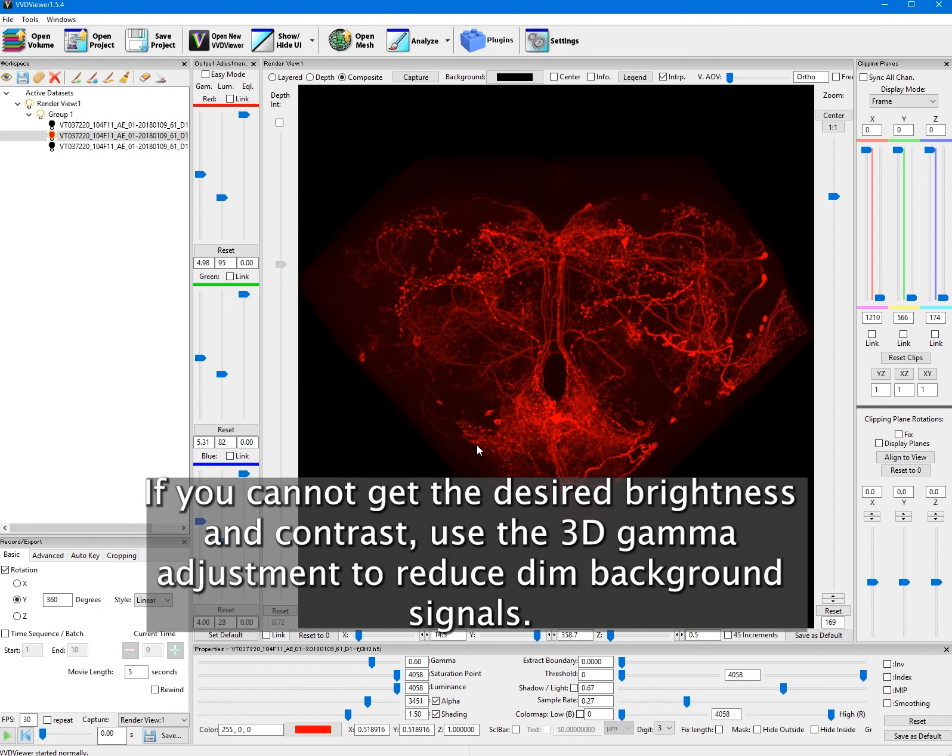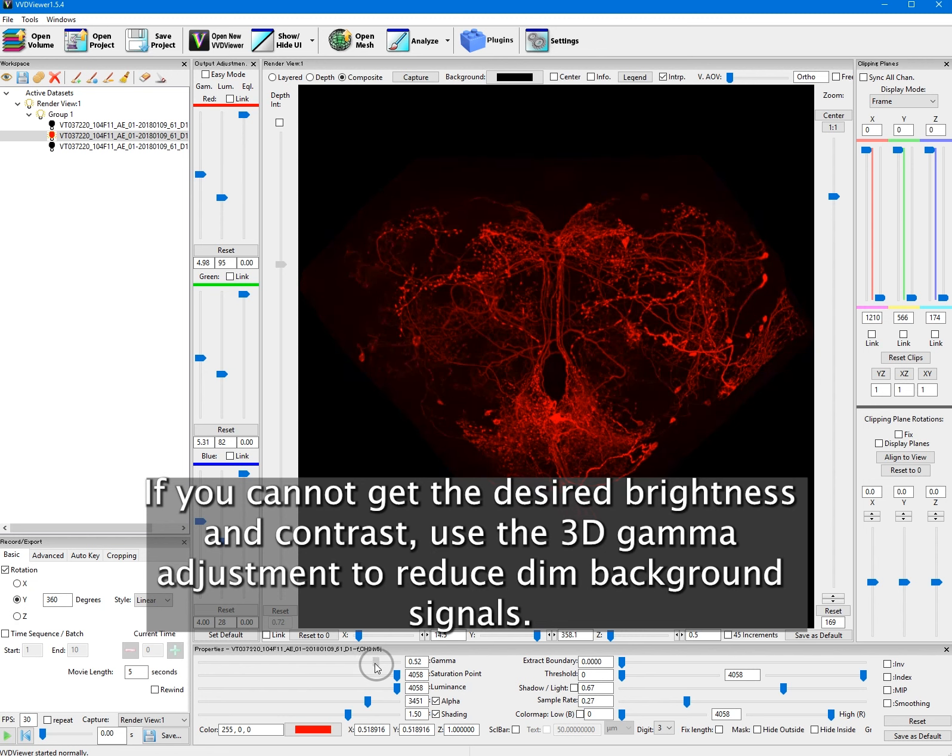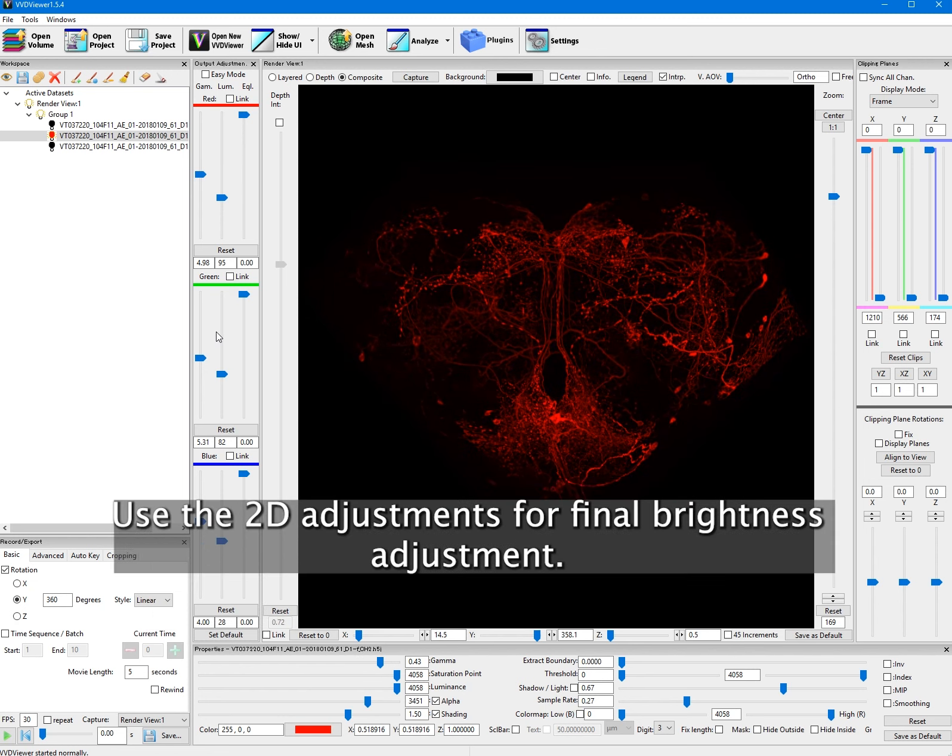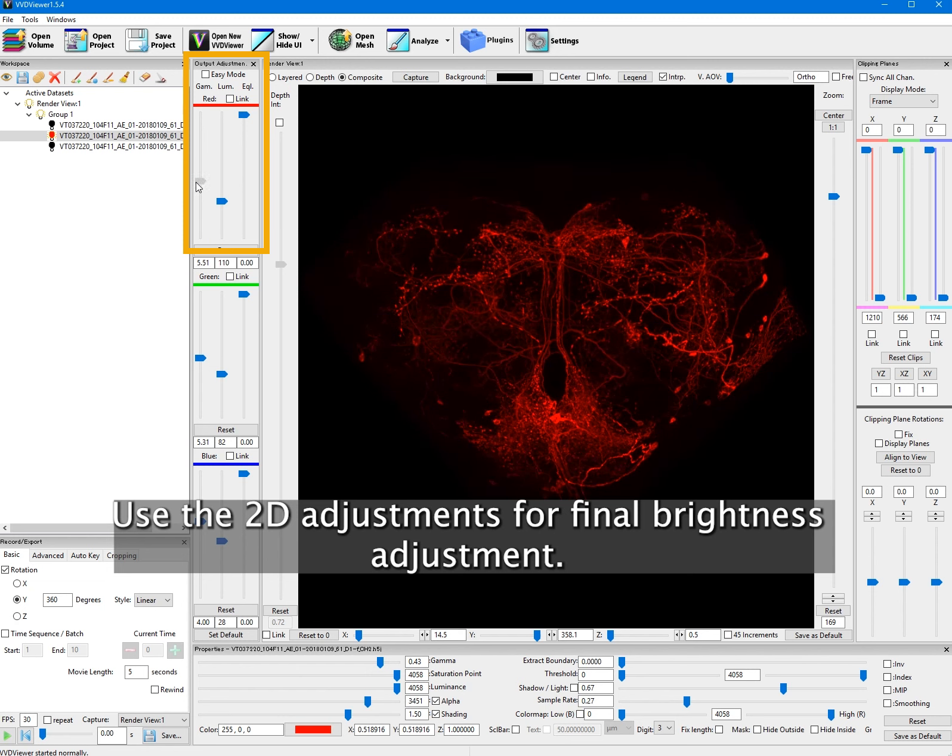If you cannot get the desired brightness and contrast, use the 3D gamma adjustment to reduce dim background signals. Use the 2D adjustments for final brightness adjustment.